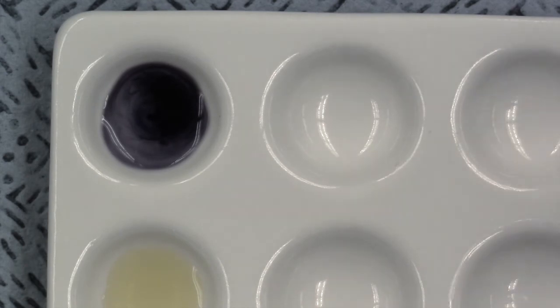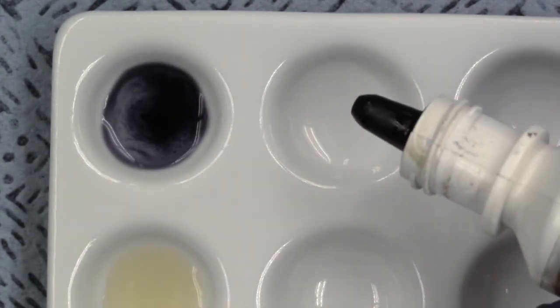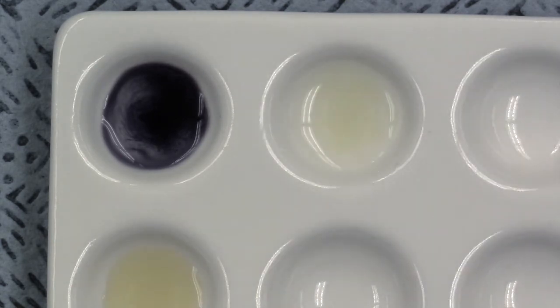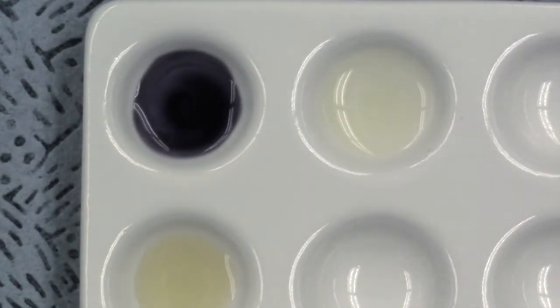Now, I'm going to take 5 drops of the starch solution, treat it with acid. 1, 2, 3, 4, 5. This is the starch solution treated with acid. Let's go ahead and put a drop in there, see what happens. There we go. And as you can see, it did not turn the same color. It stayed the yellow color of the iodine solution. So that tells me that there's no starch present in that sample.